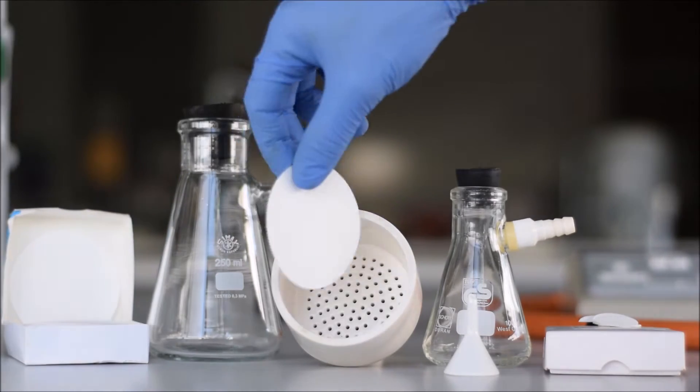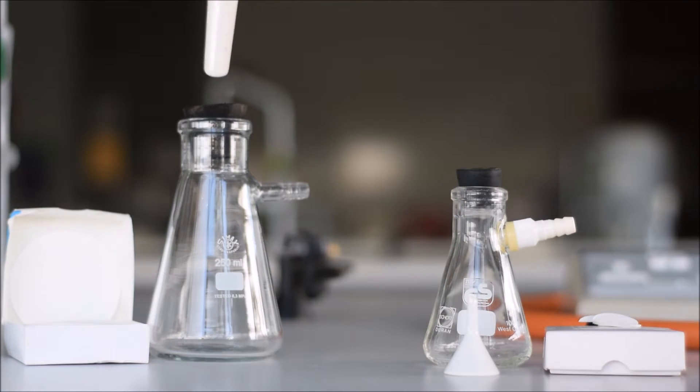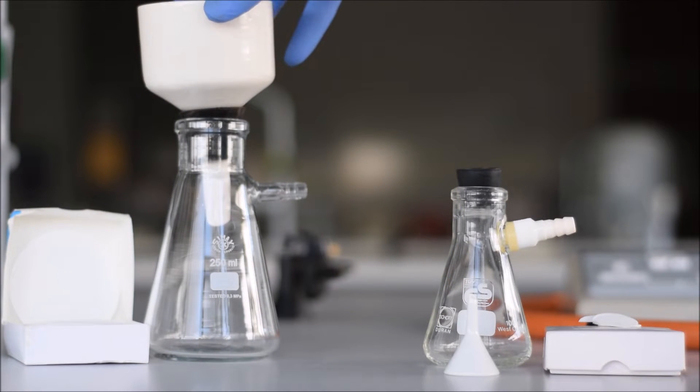You need to use a filter paper when using either of these funnels. The holes aren't designed to trap material, and having filter paper in there makes it much easier to get the material that you're trying to recover back.